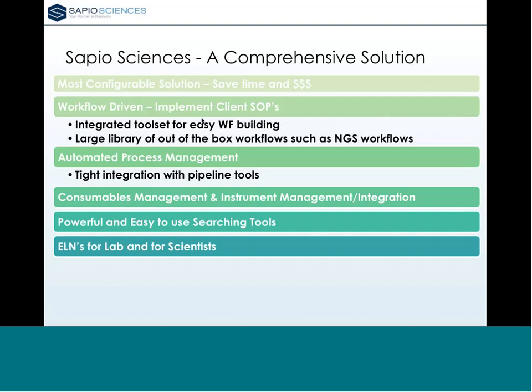So this is a different module than the workflow engine, so I'll try to distinguish what the two things are. The workflow engine is very excellent at tracking these rote, repeatable processes. You want to go step-by-step through a certain sequence and complete something through the lab, and you want to do that in a very predictable way to ensure quality and throughput, et cetera.